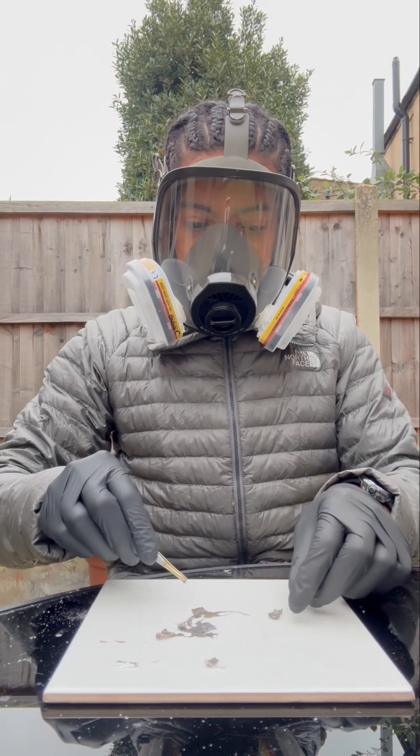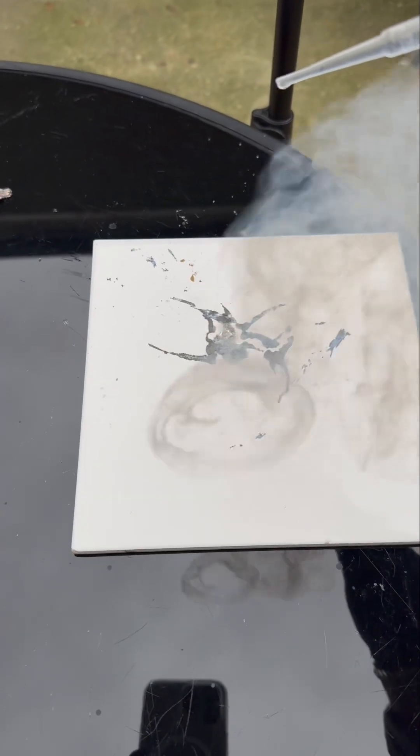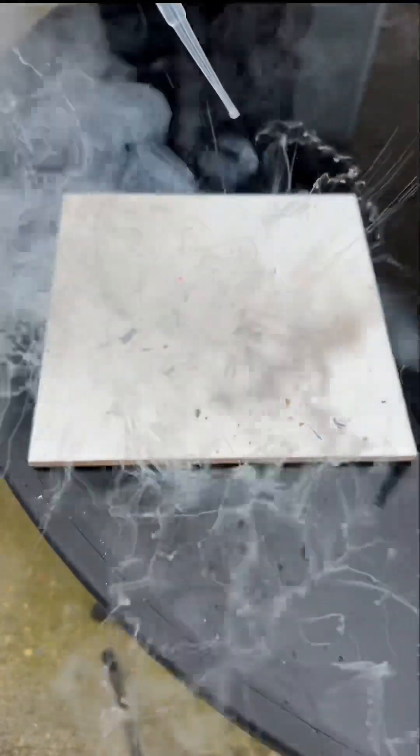So what we're gonna do now is react it with a little piece of water. Watch this. So obviously rubidium metal, when it burns, it burns with a red-violet flame. It's a mad colour — it's like a red-violet thing.